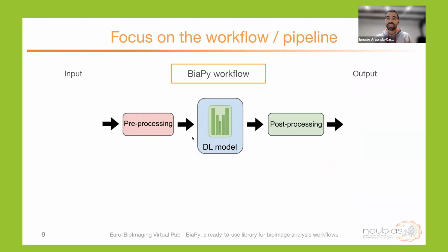Of course, now it's the trend, right? But it's also the state of the art. And then we have a pre-processing module and a post-processing step. As input, of course, we have images of any modality, size, number of channels, etc.